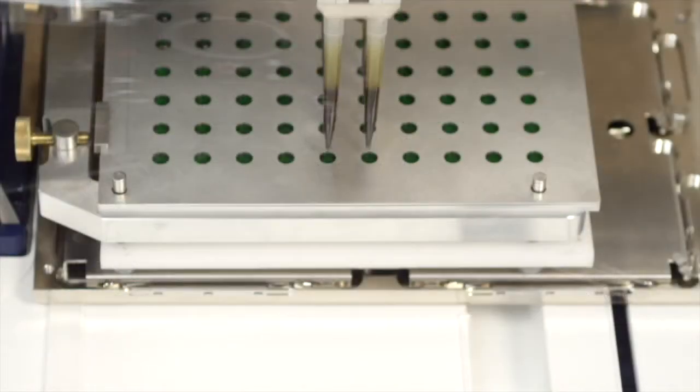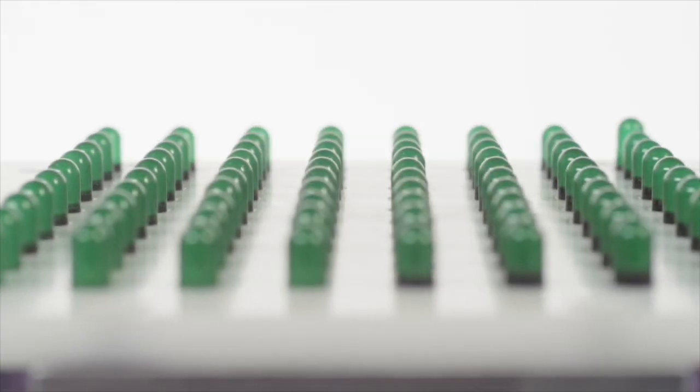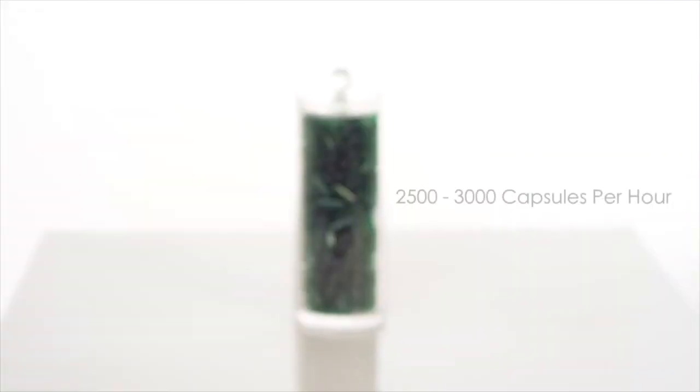This simple yet powerful liquid capsule filling machine has an average output speed of 2,500 to 3,000 capsules per hour.